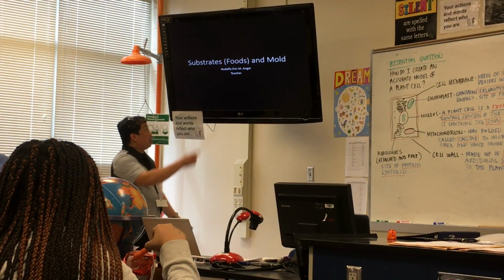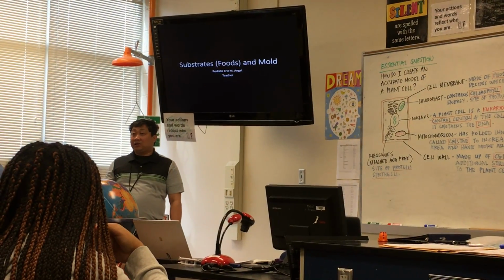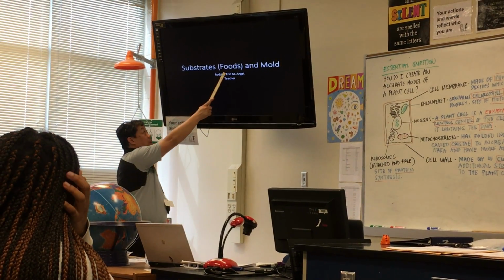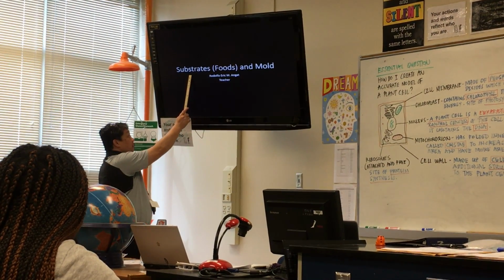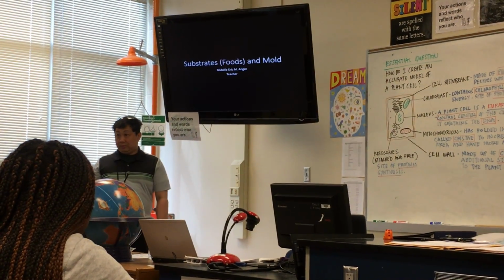Okay? So these are the substrates. And take note, in our discussion about enzymes, we said that enzymes act on the substrates, and substrates are just commonly known as the food that we eat. Now, this experiment is about the substrates or the foods and mold.